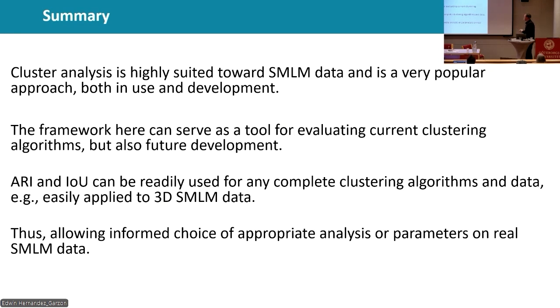But still, it can be applied to 2D and obviously 3D, even if when you do IOU on 3D on some polygons, it's not that easy. It's harder than with images, but still you can do that. And then, as I said, it can help with your analysis of single molecule data.